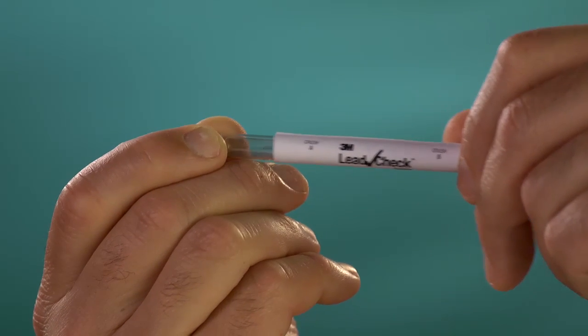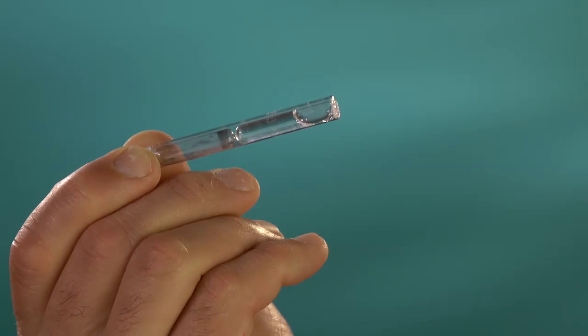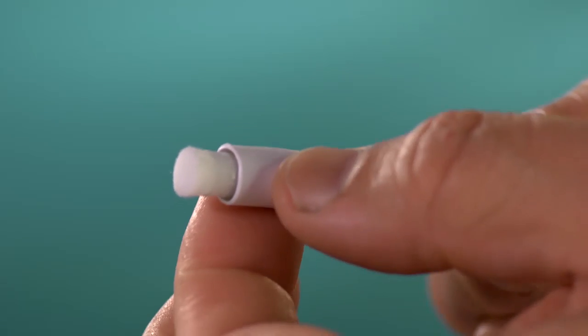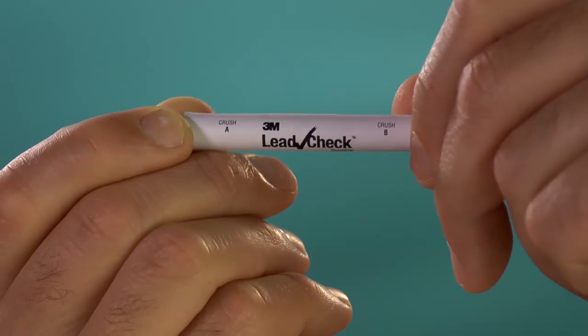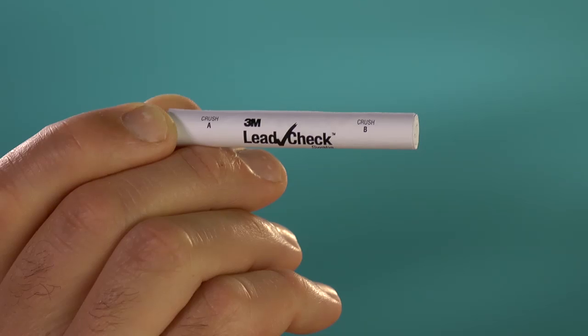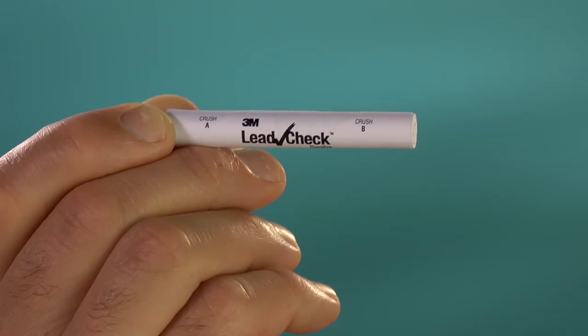Note that there are two separate glass ampules inside each 3M LeadCheck swab and that both must be crushed to activate the reagent liquid. Do not crush these ampules unless the cardboard cover is in place completely covering both of the glass ampules.